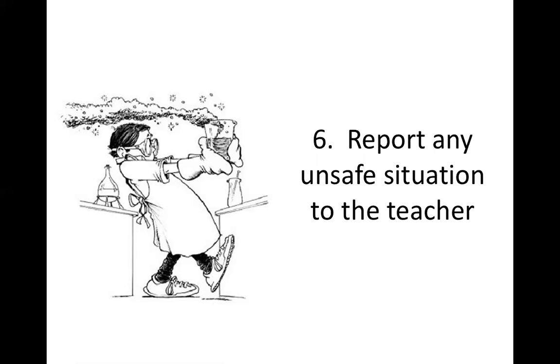Another example, in the chemistry laboratory, we have sources of gas, LPG, because we use fire in some kinds of experiments. And when you enter the laboratory, it smells like some gas was leaking. So you have to tell the teacher so that the teacher can check if one of the gas tanks was left open, so that it can be closed, and then we have to evacuate the place and wait for the smell or the leak of the gas to dissipate. Okay, so you have to tell and help the teacher if the laboratory or the situation is safe for you to do experiments.